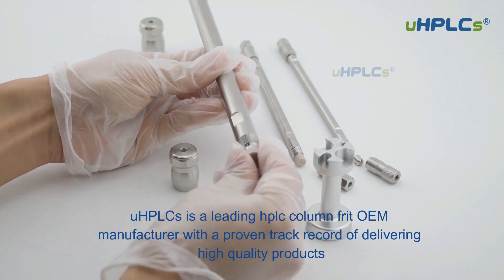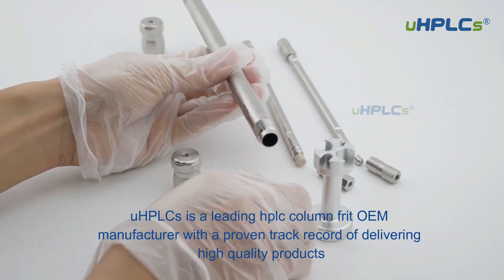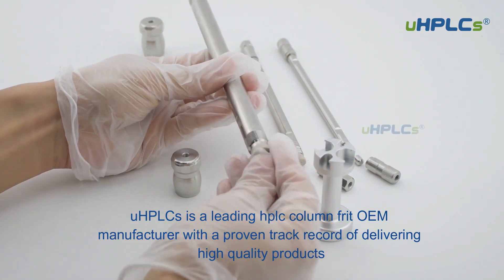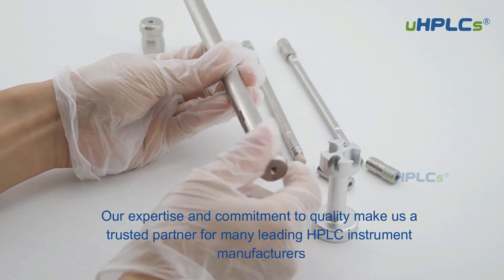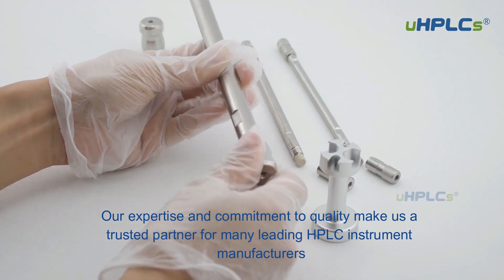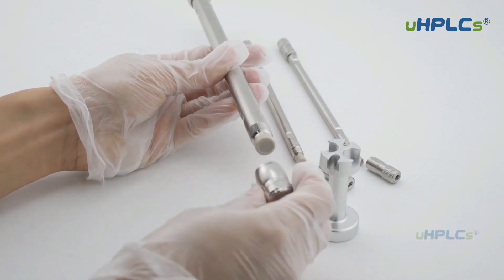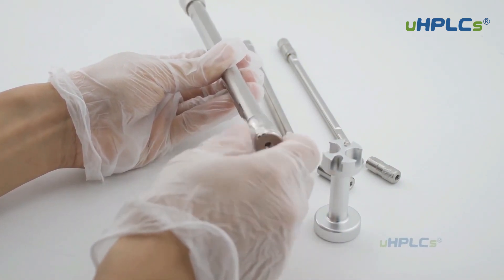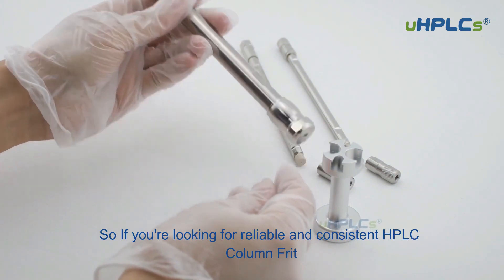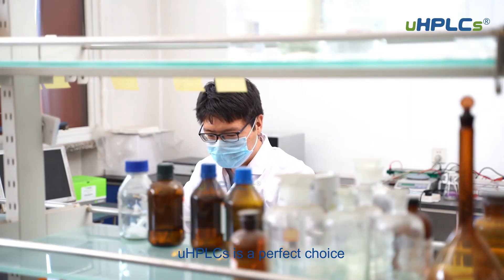UHPLCs is a leading HPLC column frit OEM manufacturer with a proven track record of delivering high-quality products for many leading HPLC instrument manufacturers. So if you're looking for reliable and consistent HPLC column frits, UHPLCs is a perfect choice.